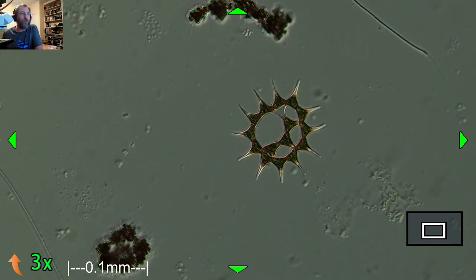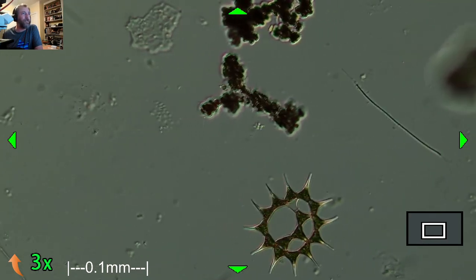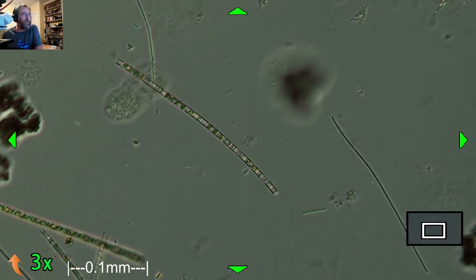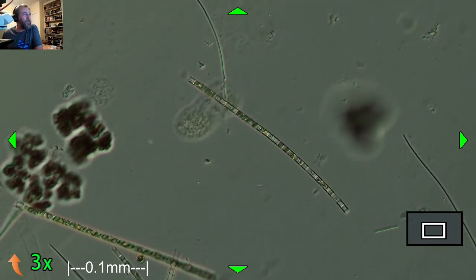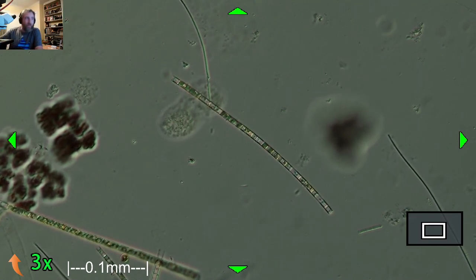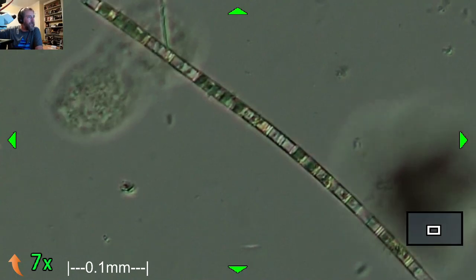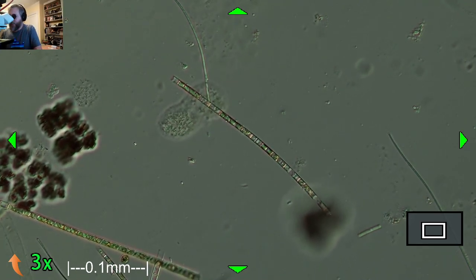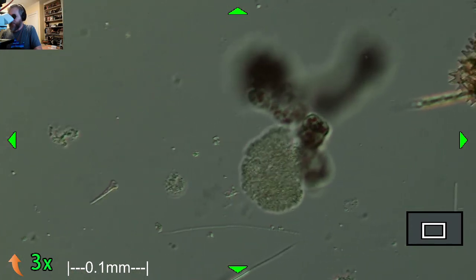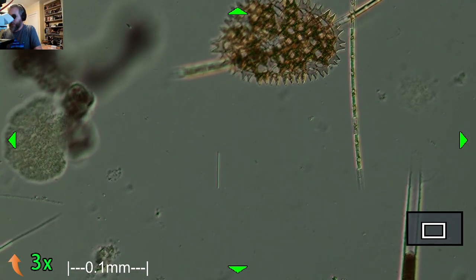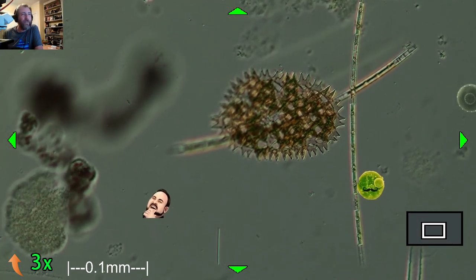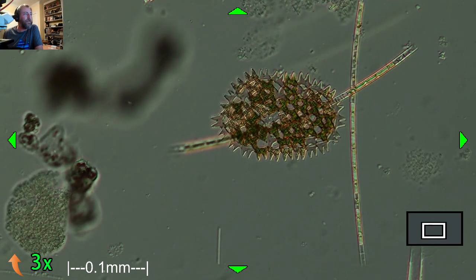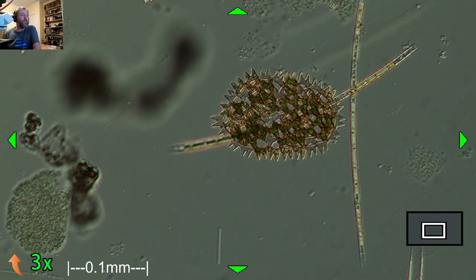That's an Olicasaira right there if you wanted to make a link that would actually get people to the diatom. That's Oscillatoria, or that's an Olicasaira right there. I think it's Olicasaira Ambigua. And this thing down here, another Pediastrum. The bamboo of diatoms, it's pretty much like bamboo. This gear-looking thing is a Pediastrum. They look like little kaleidoscopes.